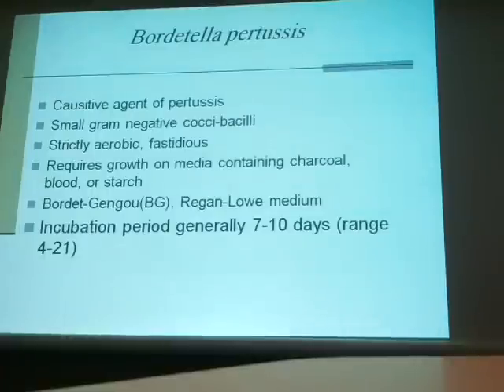The bacteria on this media give a whitish colony. Okay, any question?